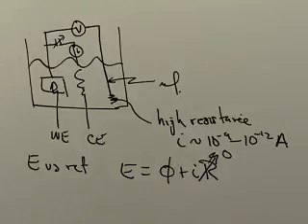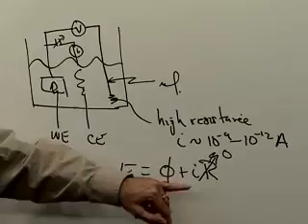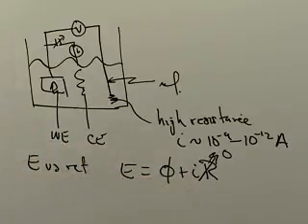Now, if you look at the specs on most commercial potentiostats, they will tell you that they'll hold the voltage plus or minus 10 millivolts. Most people don't bother to read that and often report their potentials to greater significant figures than that. You could buy a better potentiostat, but 10 millivolts is a typical number. So if I can keep I times R below 10 millivolts, I'm in great shape. Keeping it around a millivolt isn't going to be very hard. That is below the accuracy of the potentiostat, so I'm fine.